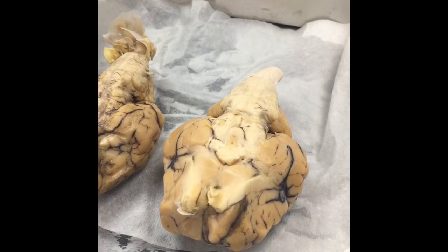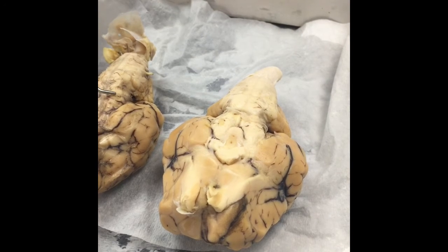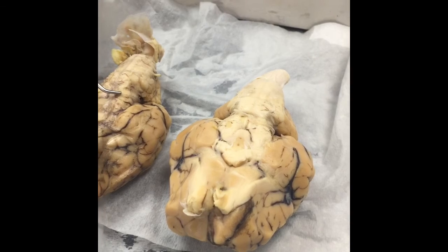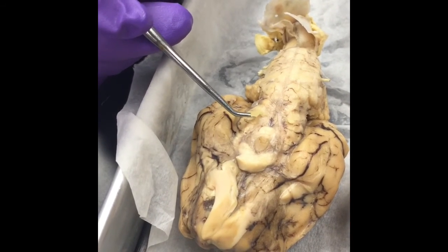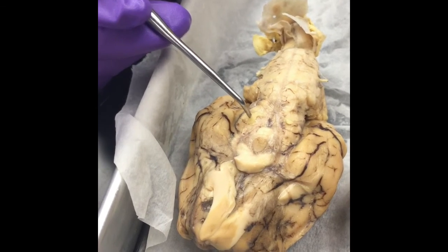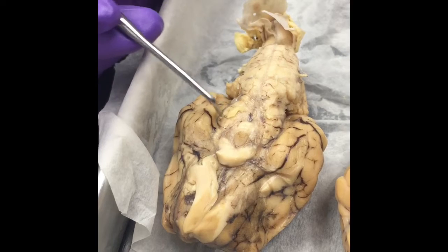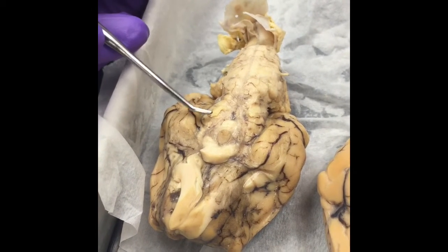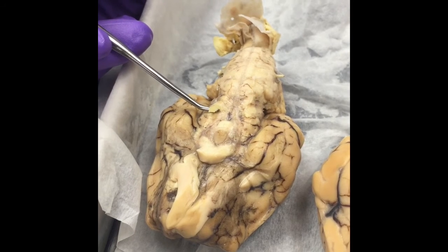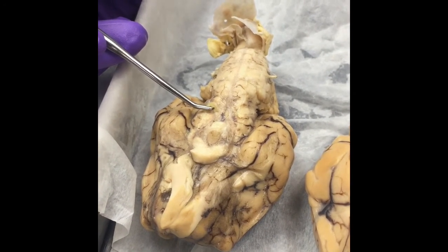So this cranial nerve over here, this is cranial nerve number 3. There should be another one over here. You see where it was kind of cut off from? See that little guy? It looked like this. This is cranial nerve number 3. This is called your oculomotor nerve. This is one of the nerves that gets your eyeballs to move back and forth in different directions. And we have 3 nerves that actually have to work together in order to get your eyes to move in different directions.